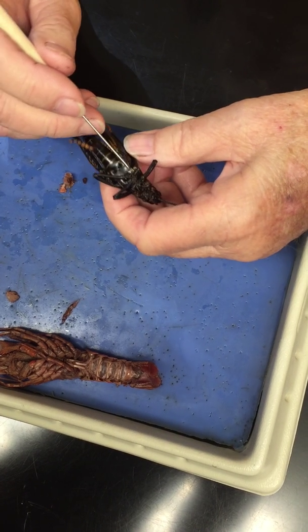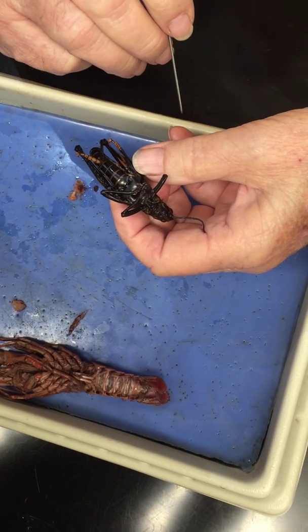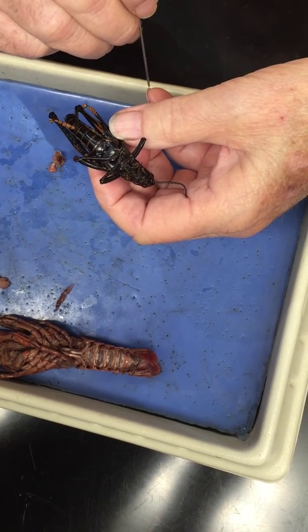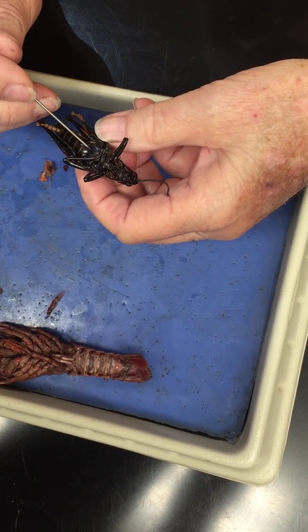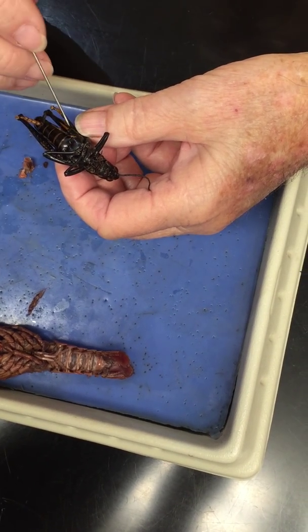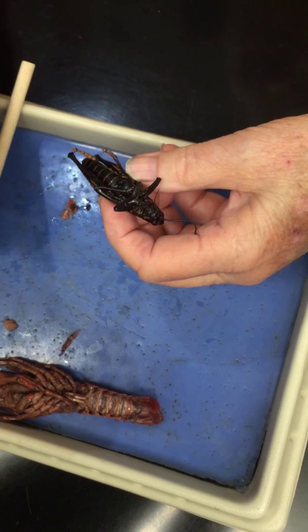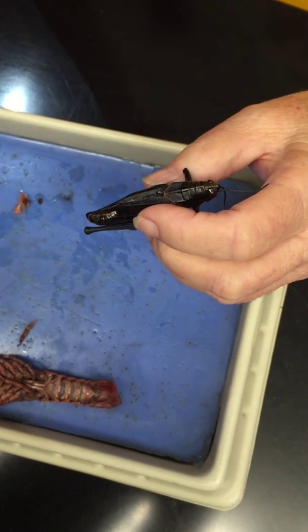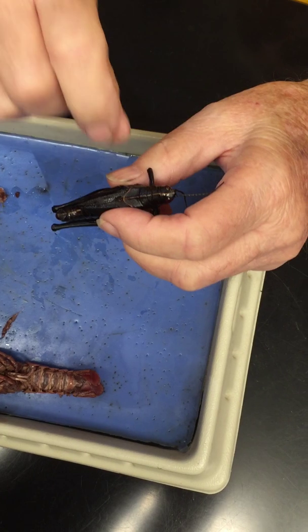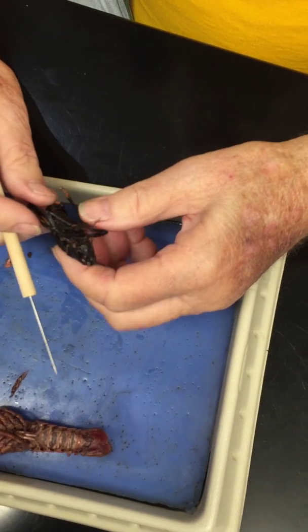Now notice the invaginations here on the mesothorax. There are where the muscles for the mesothoracic wings are attached. These invaginations on the metathorax are where the metathoracic wing muscles are attached. Now, those muscles don't actually make the wing flap up and down. What they do is they squeeze the thorax like this, right? The wings are made like a hinge. So the hinge flaps up and down when the thorax changes its shape vertically because of the muscle.